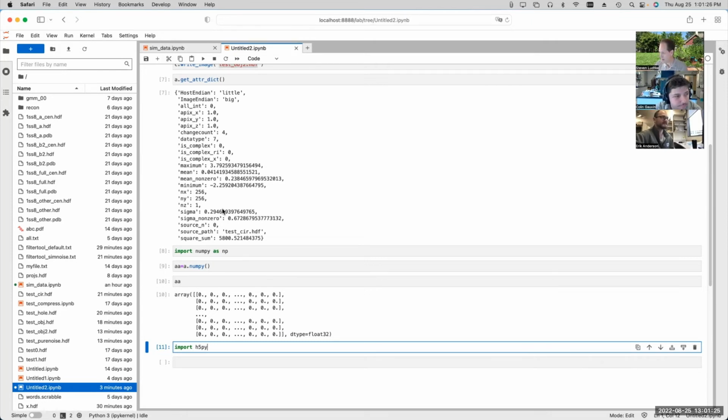It depends a little on the program. So with the Gaussian mixture model stuff, those networks are all being saved right now as HDF5 files. Some of Muyuan's earlier segmentation programs, I think you're right. I think he may be saving some of those, turning some of those into images and saving them as images, and then turning them back into TensorFlow objects or something like that. I don't remember off the top of my head.